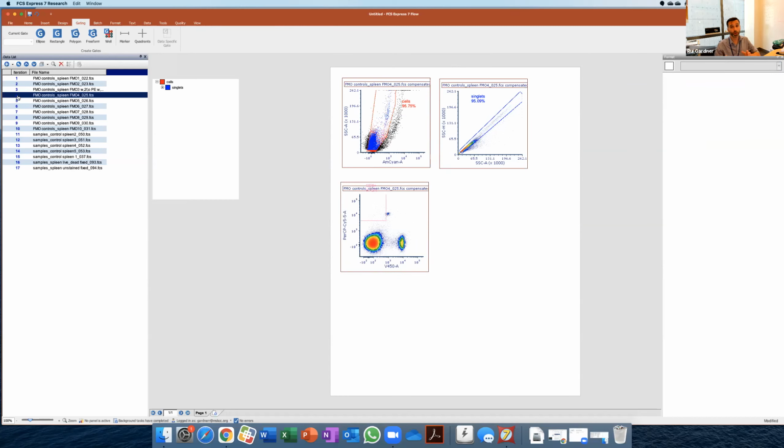So one other thing that we forgot to mention also about the FMOs is the FMOs have to be the same sample, right? We've seen people sometimes bring, just to save their precious sample, setting FMO controls in another tissue. But as Derek was explaining, we want to take into account all the photons that are coming from the other fluorochromes. And so these depend on the levels of expression of the other markers that are labeled with a fluorescent probe. So to do so, we need to label exactly the same sample that we are trying to compare with. So that's very important. And sometimes it's very difficult.